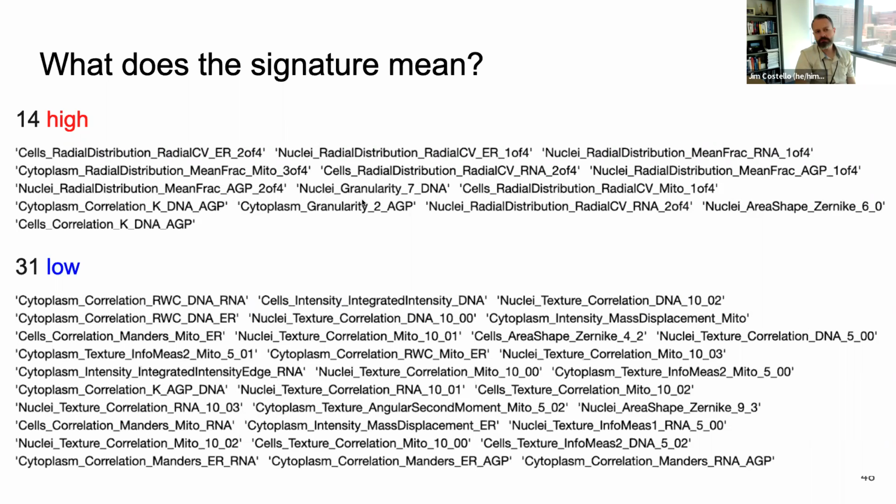Have you, or have people, linked genetic alterations or perturbations to some of these feature sets? Yeah, people have tried to do that. Because we have this LINCS data set with matched Cell Painting and L1000, people have tried to predict one readout from the other using that same data set.